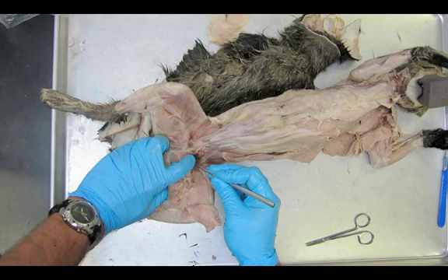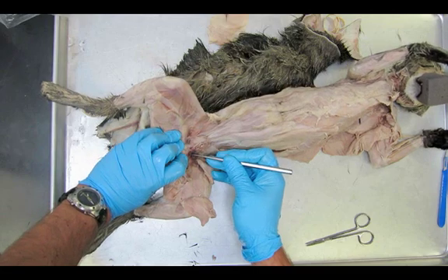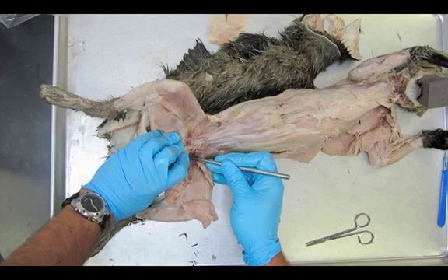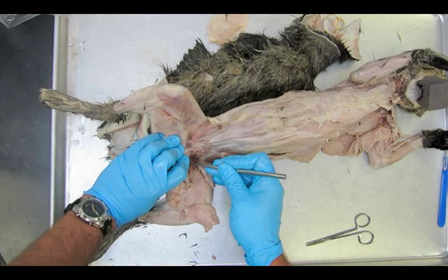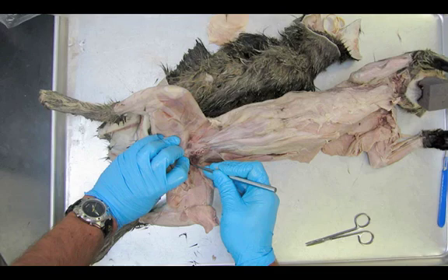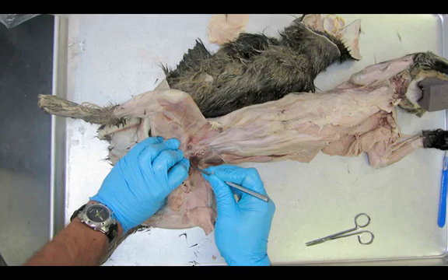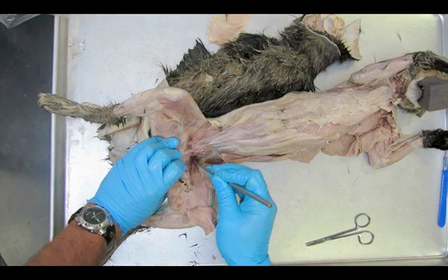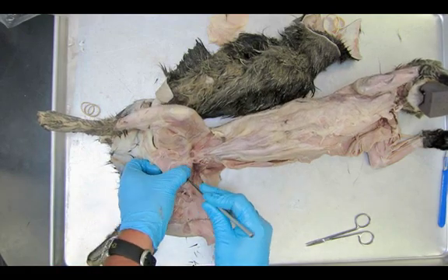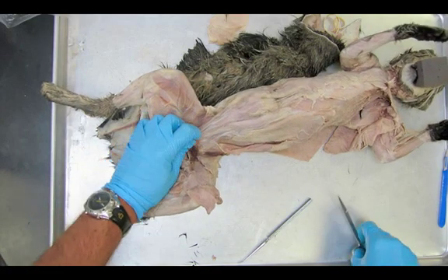The pectineus is an extremely hard muscle to find. Some people will luck out and have a very easy specimen. I'm just carefully moving it away from the adductor longus. Doing pretty well here: semi-membranosus, adductor femoris, adductor longus, and pectineus.